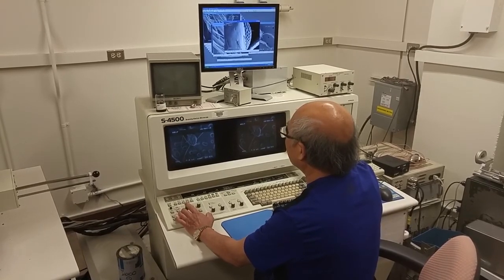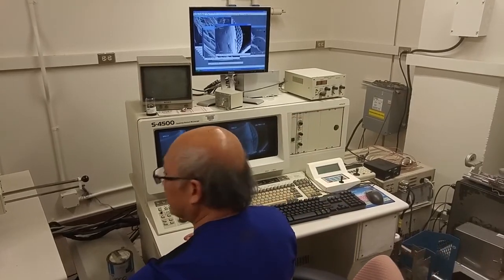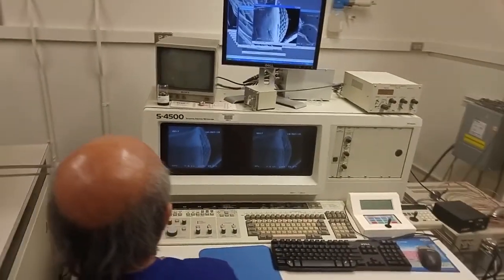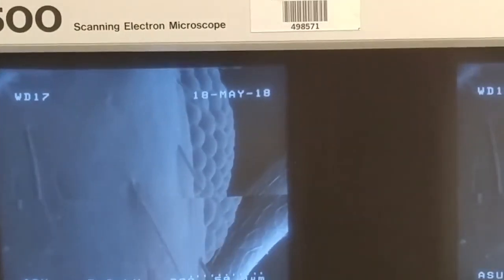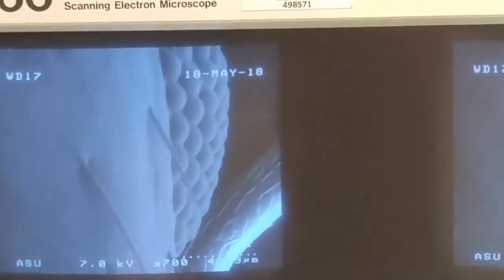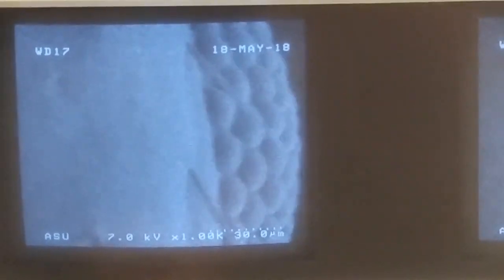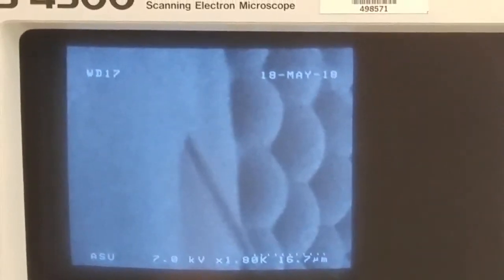I'm taping you. All right, let me go over here. One of these little hairs here — center. It's up to you. I'm not sure, it looks fine to me. The center down focus.